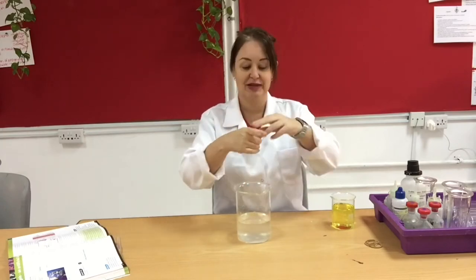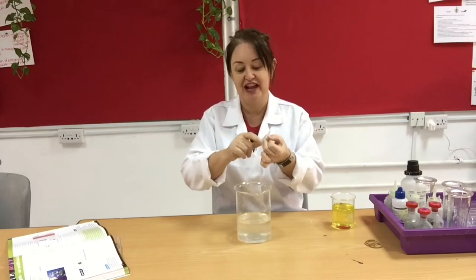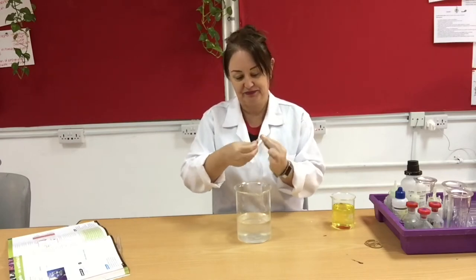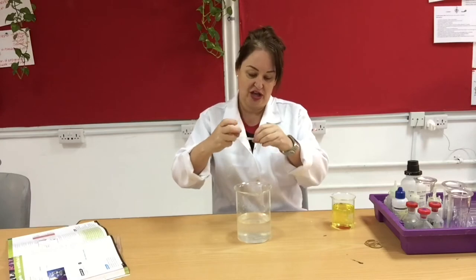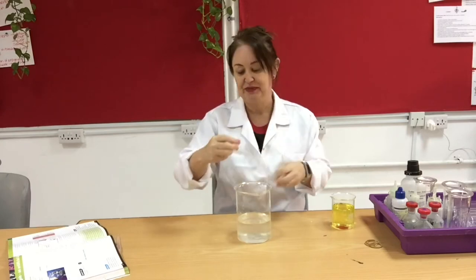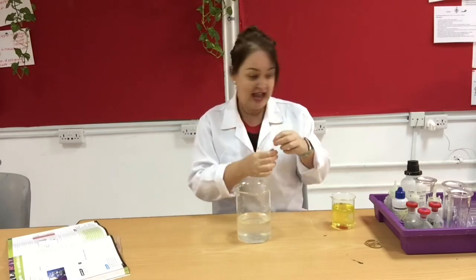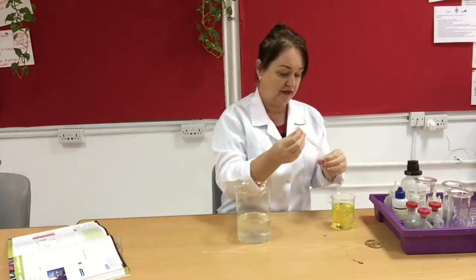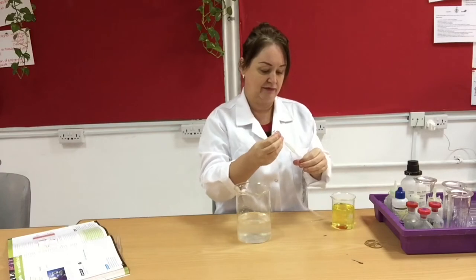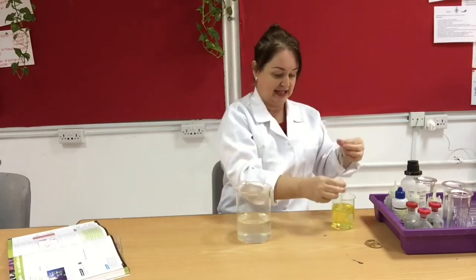At the other end I'm going to tie a knot in this - this is why you need a fairly long piece. Tie a knot in that and try to move the knot as close to the end as possible, then continue to rub that bit, and then I'm going to use a pipette to move some of the blood plasma into here.